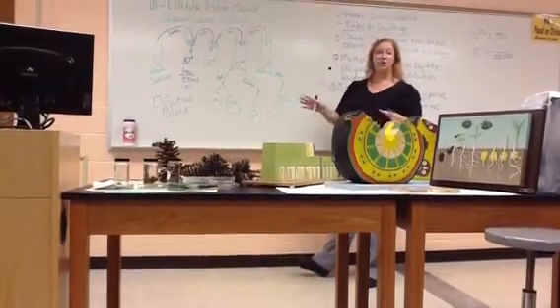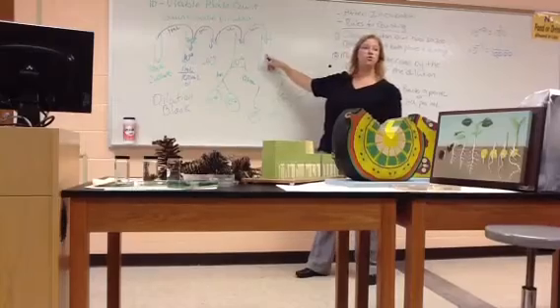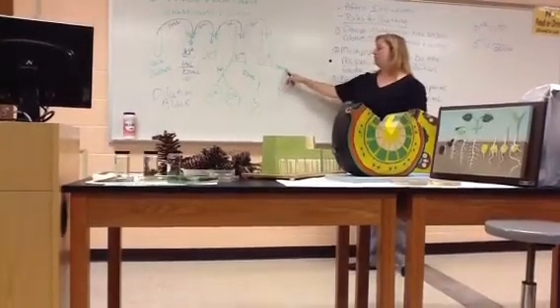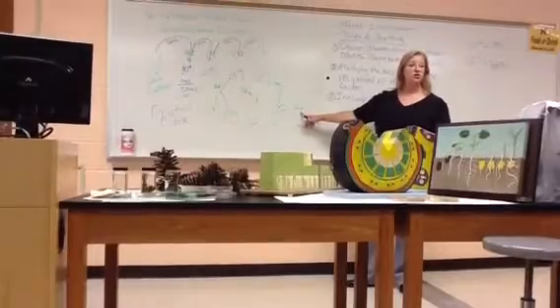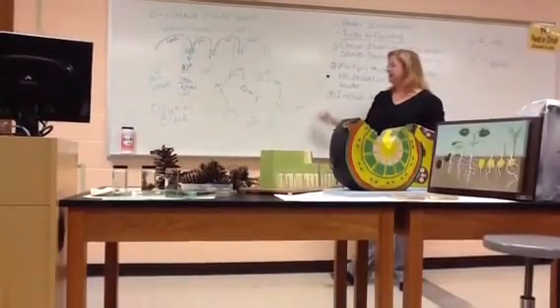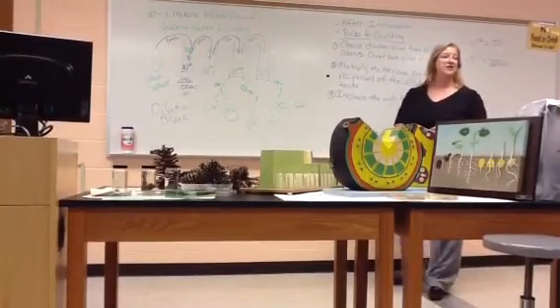And then get a brand new pipette, because that pipette just touched 10 to the minus 6. We got to get rid of it. Get a brand new one to stick into 10 to the minus 8. And we're going to plate that. 1 full ml of liquid, again, duplicates. A full ml into this nutrient agar plate, a full ml into that nutrient agar plate. We'd spread it out across the surface. And they all go into the incubator. 18 to 24 hours, 37 degrees Celsius, just like everything else we incubate.